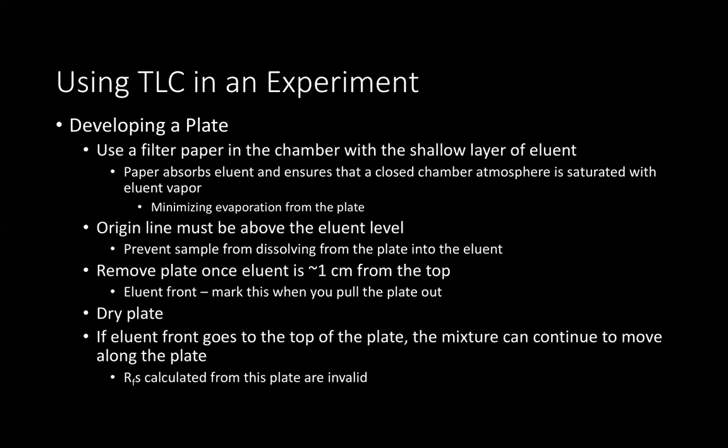Once your eluent has moved up your plate and is about 1 centimeter from the top, that's when it's good to take your plate out. Admittedly, some solvents do move slower, ones that are slightly less volatile than others, and sometimes you may take the plate out when they're about 2 centimeters from the top. But you just need to always draw where your solvent line got to.